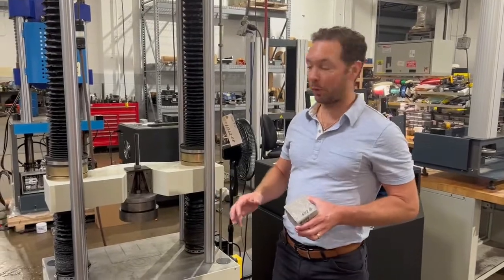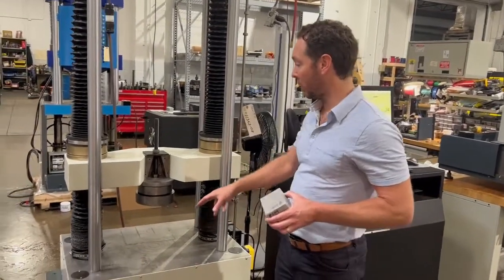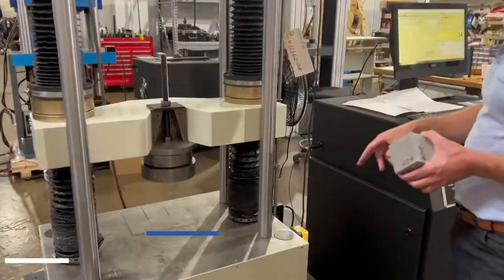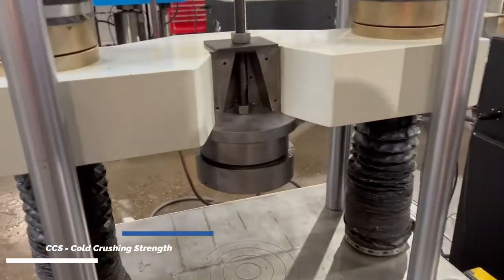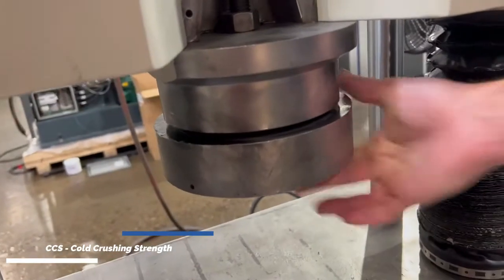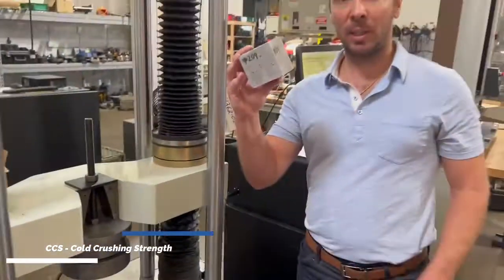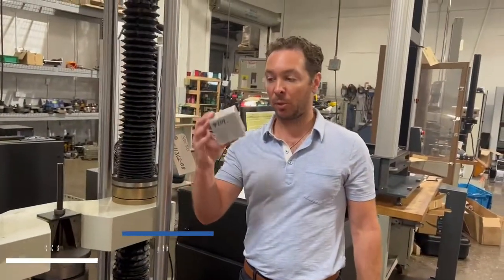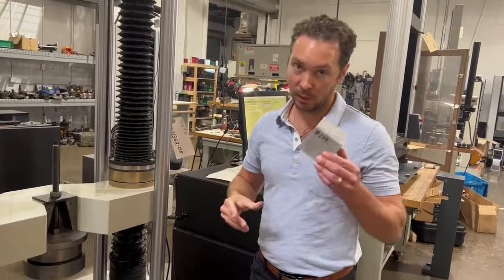We just switched over from our MOR fixture to our CCS cold crushing strength fixture, which is a spherically seated compression fixture. Here's our specimen. It is a 3x3x3 cube and it's ready for testing.